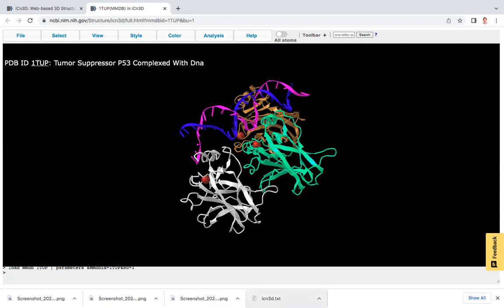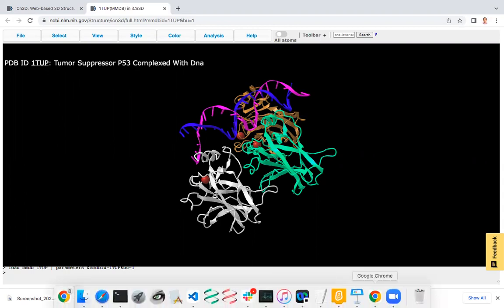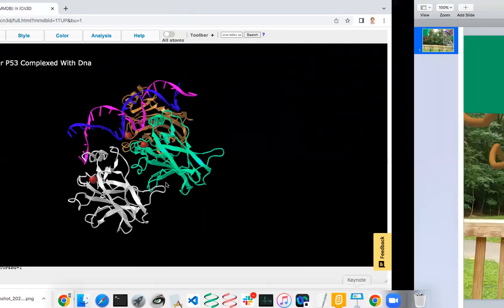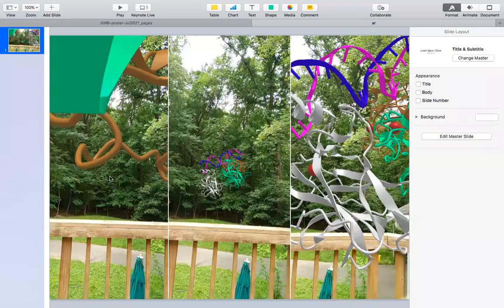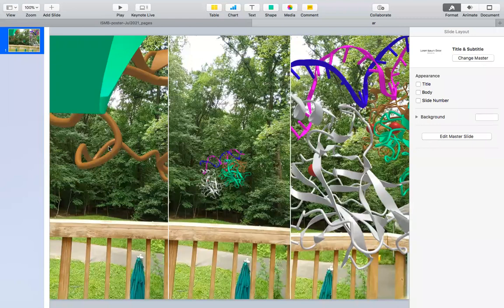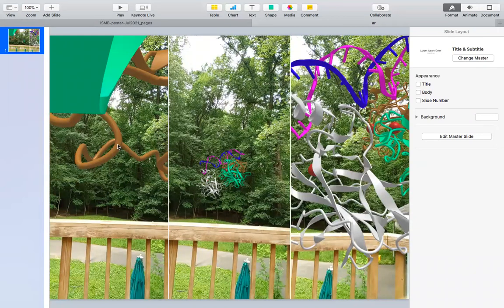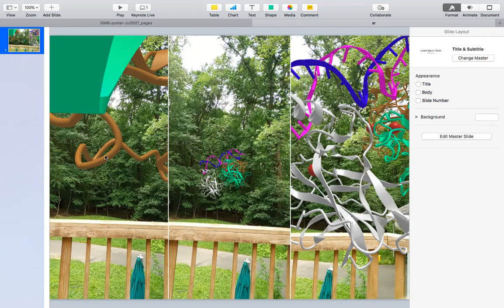So if you click that, you will see something like on the left panel, you will see the huge protein in your surrounding. You are actually still standing in the middle, in the center of the structure.